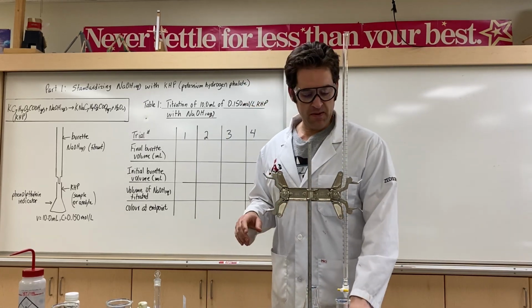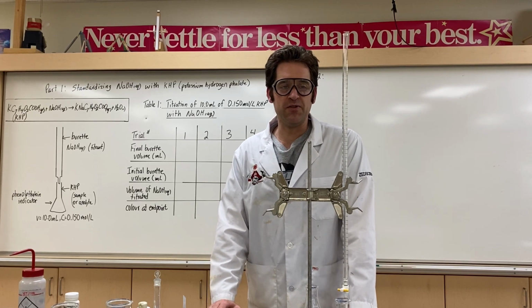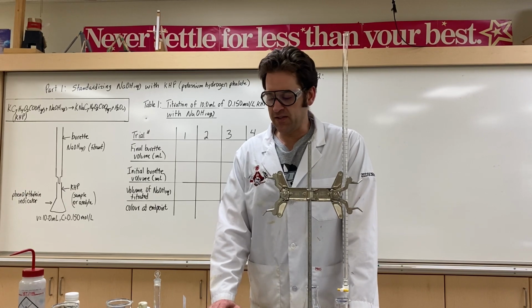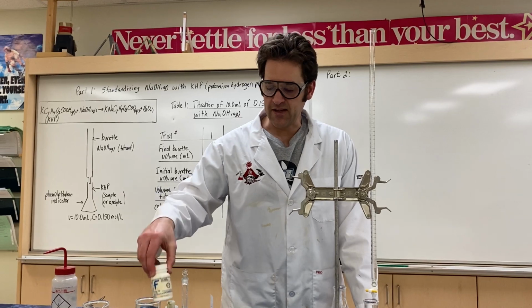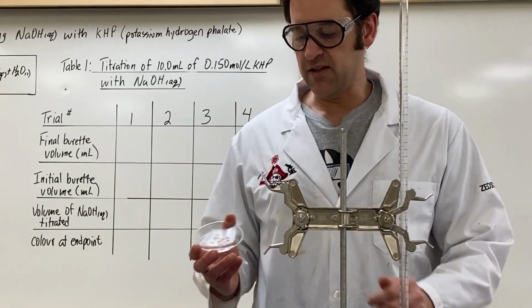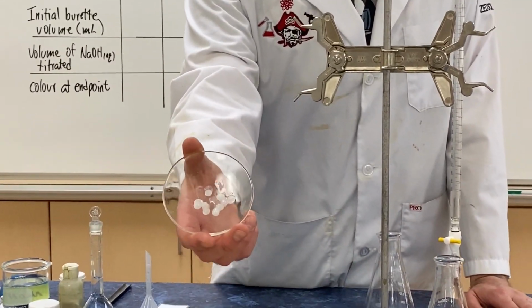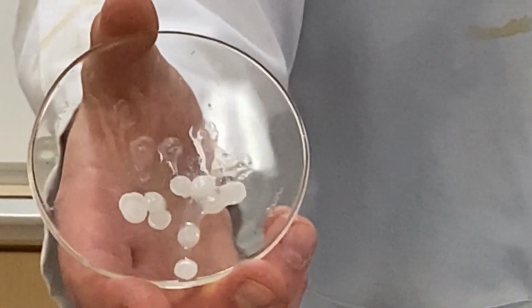Now, Zdog made a good point to talk about why we can't use sodium hydroxide as a primary standard. The main reason is sodium hydroxide is this very powerful base. It comes in pellet form, usually, and it absorbs water like crazy. When did you put these on the dish, Zdog? Just a few hours ago? Yeah. What are they looking like now?